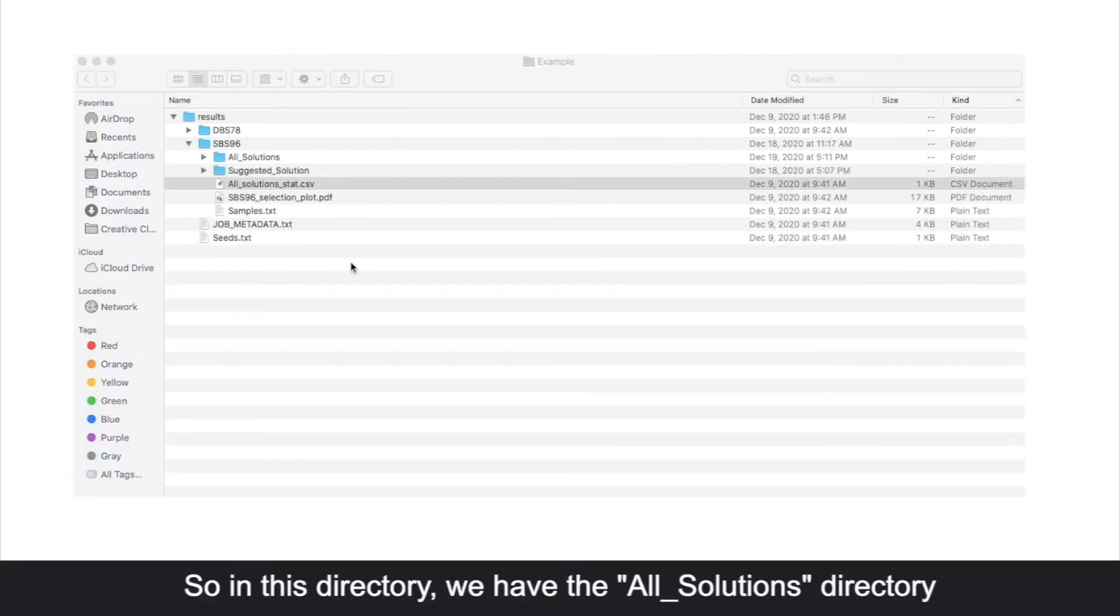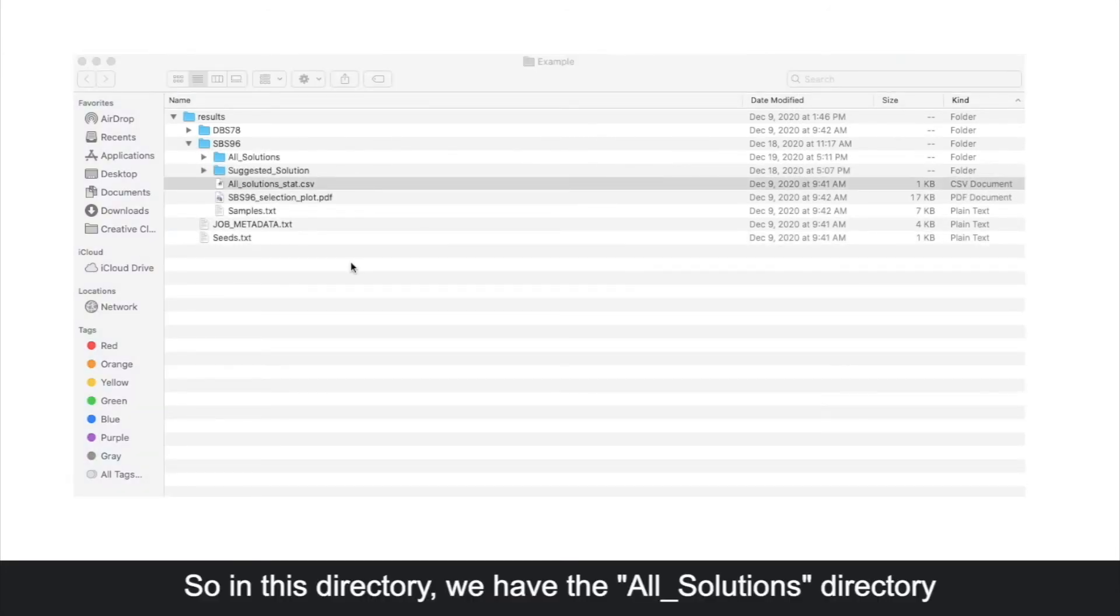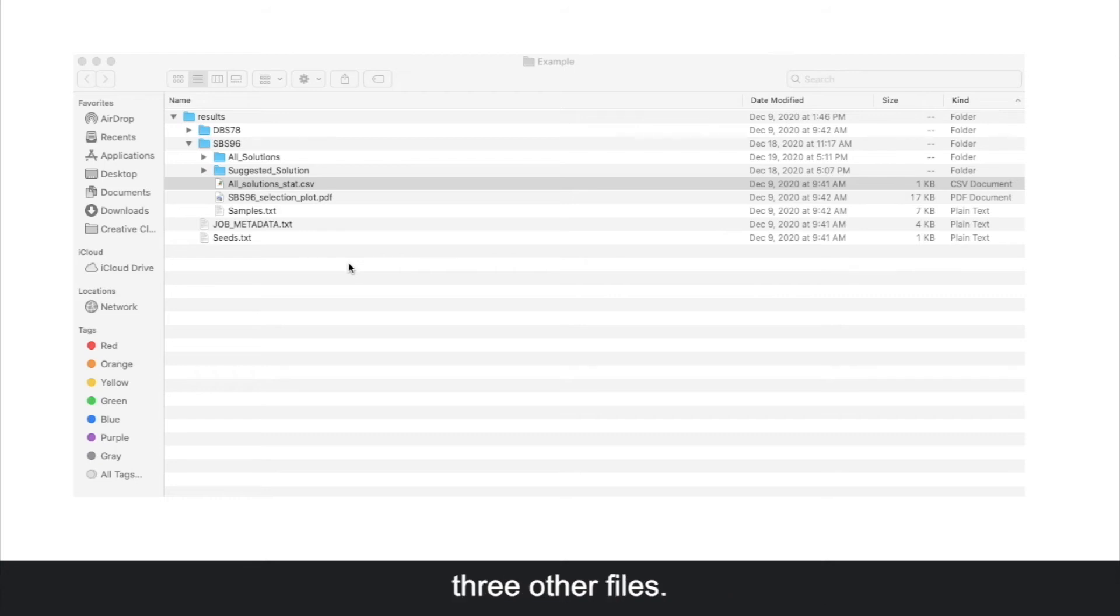In this directory, we have the all solutions directory and suggested solution directory, as well as three other files.